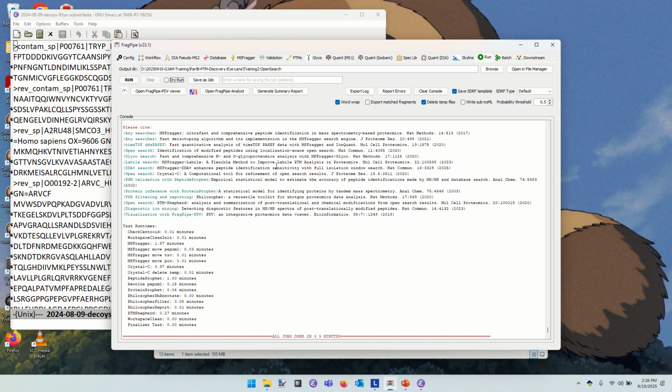So if you tell your software that I might have mutations in these data, and it says I see a whole lot of cases where proline has been replaced by leucine, that's one plausible explanation for why you gained 16 on a proline. However, the biochemists and the cell biologists will tell you that's just silly. The sample you were analyzing had a bunch of collagen in it. Collagen has a lot of hydroxyproline.